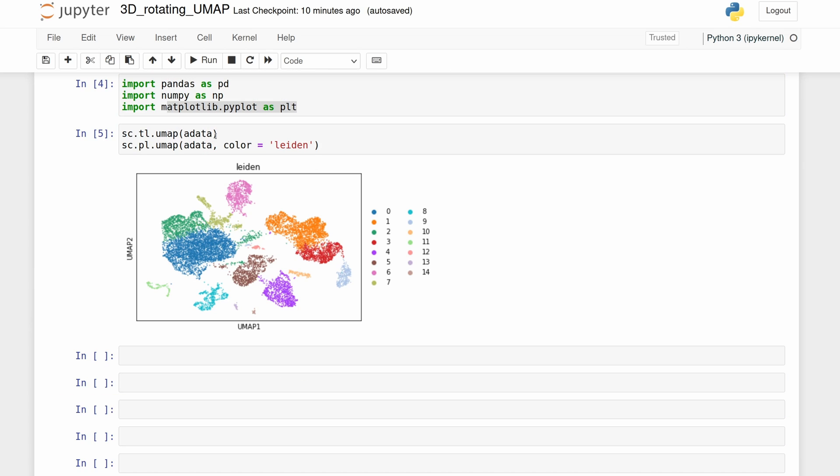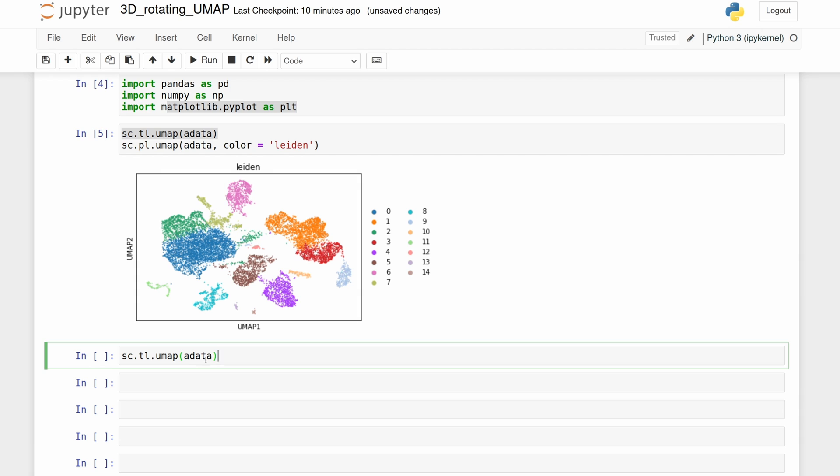But of course this is 2D, so let's just take the same UMAP function but pass in components equal to 3.